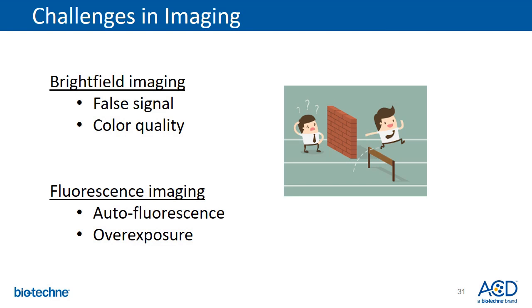Getting good images is essential. Here I will touch upon the challenges in imaging. For bright field imaging, I will discuss false signal and color quality. For fluorescence imaging, I will go over autofluorescence and overexposure problems. These are the main challenges for a microscope user and an image analyst — sometimes we can go around them, and sometimes we have to address them directly.